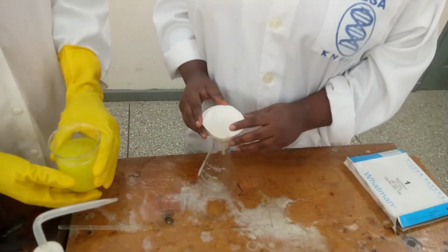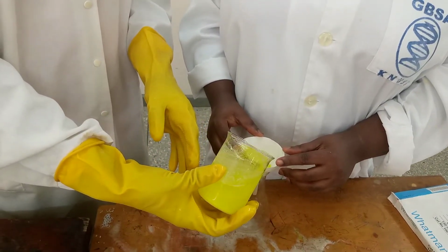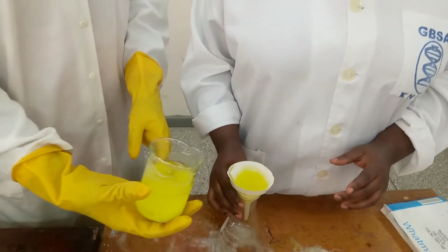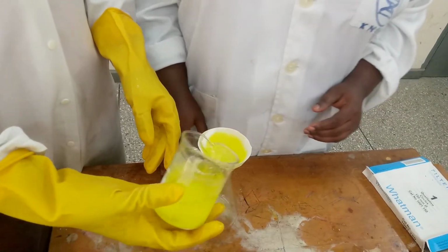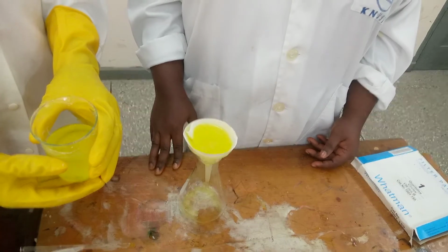Then I will pour it. This one you have to be very, very patient to get our crystals.